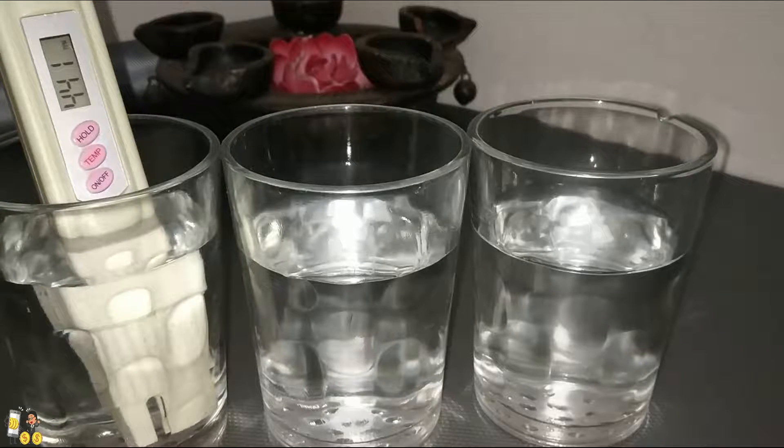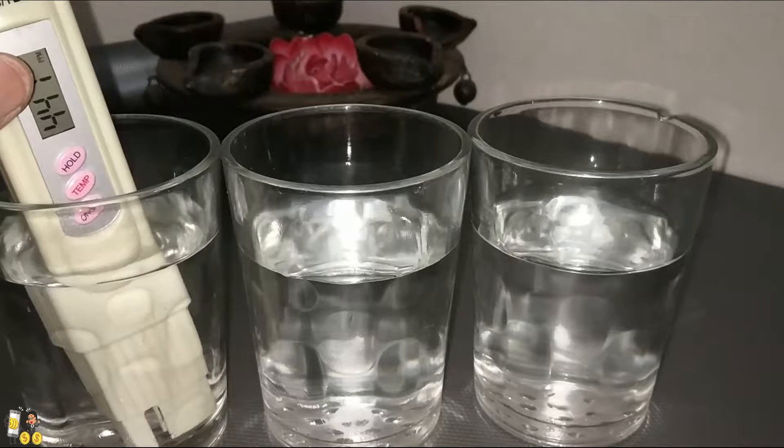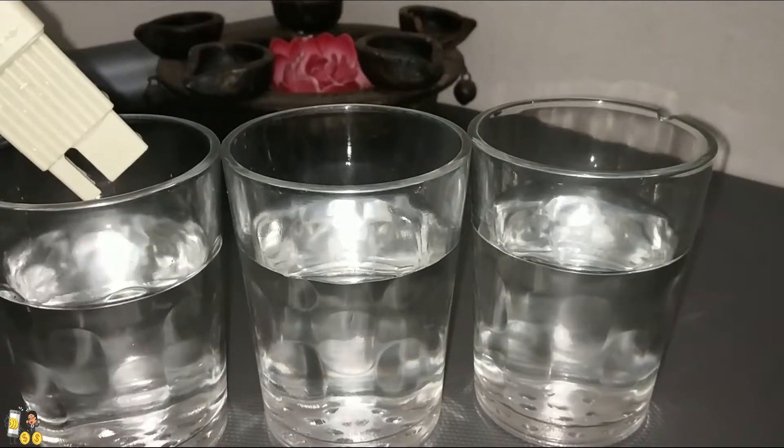We immerse the TDS meter in the tank water and wait for 30 to 45 seconds. As you can see, there is no fluctuation in the reading, which means the PPM level of my tank water is 441 PPM. After this video you can check what readings are safe for drinking water.